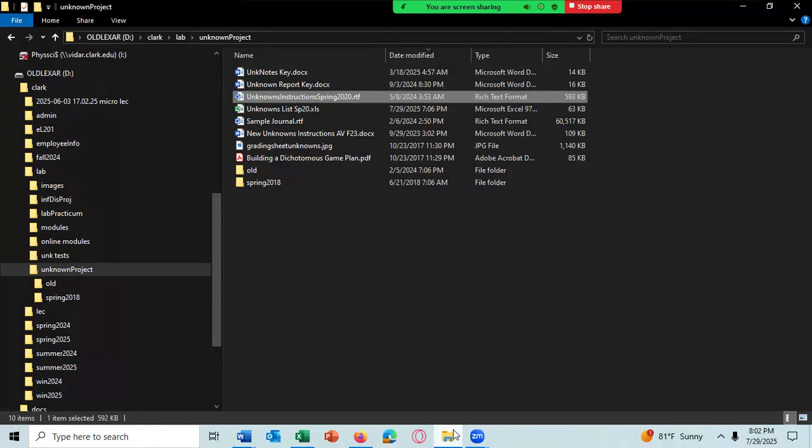You can write in your unknown notes that you're starting the gelatin hydrolysis test today, although I'm pretending to give you the number and you're streaking it out, so you can write that in your unknown notes page as well to get a pure culture. So you need to streak it out twice on 2 separate plates and grow up the cells on one plate, then take those cells and grow them on a second plate. It'll take you a few days to do that, but you should pretend to do that. I'm not going to mark you down if you don't write anything in your unknown notes, but those are things you could do.